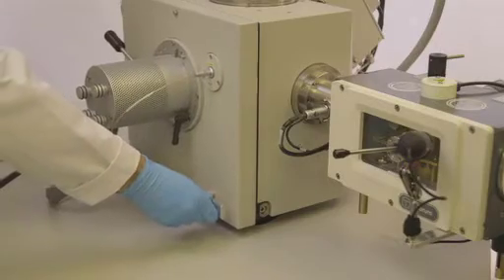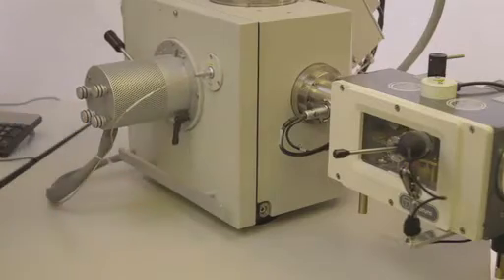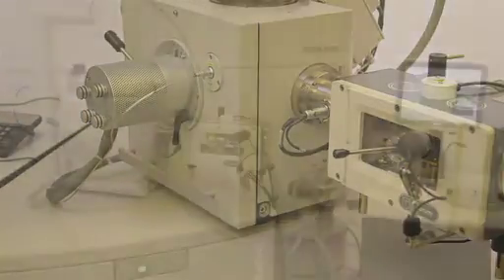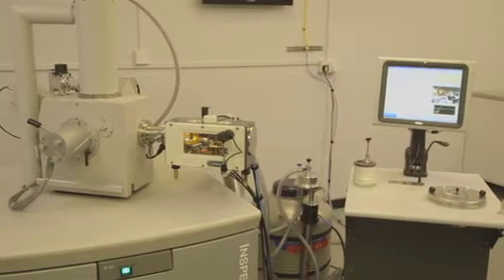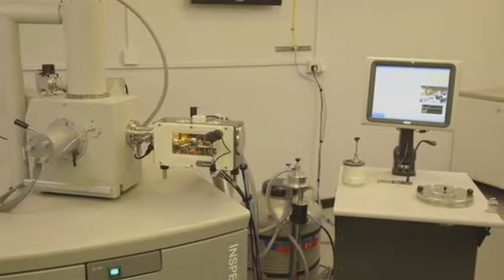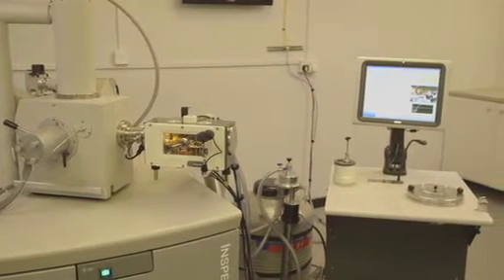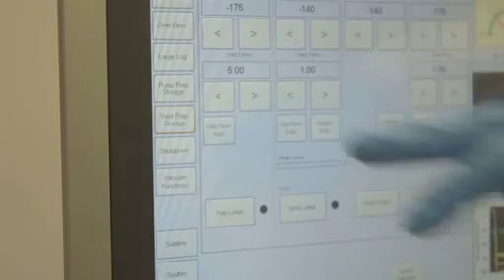Superb thermal efficiency means the 3010 can typically run for up to 24 hours on one single fill of liquid nitrogen, allowing unattended overnight operation.